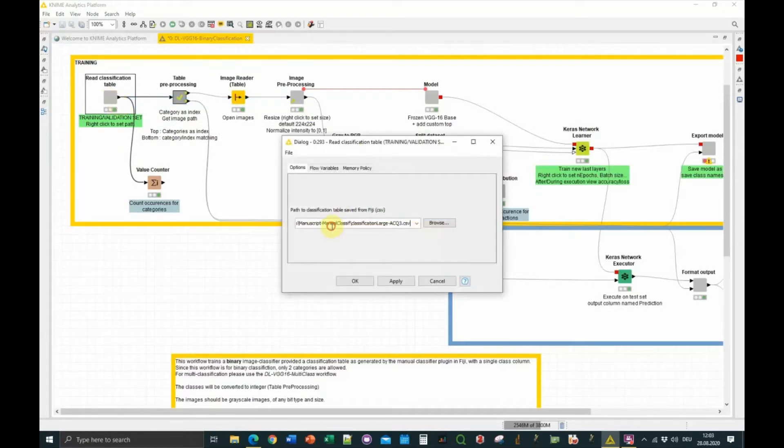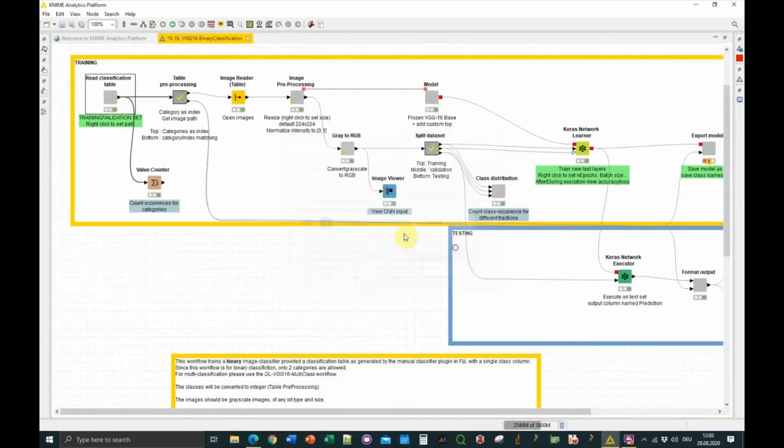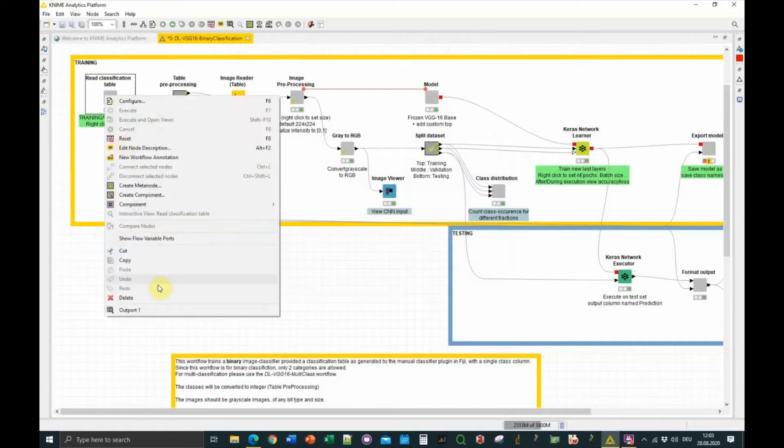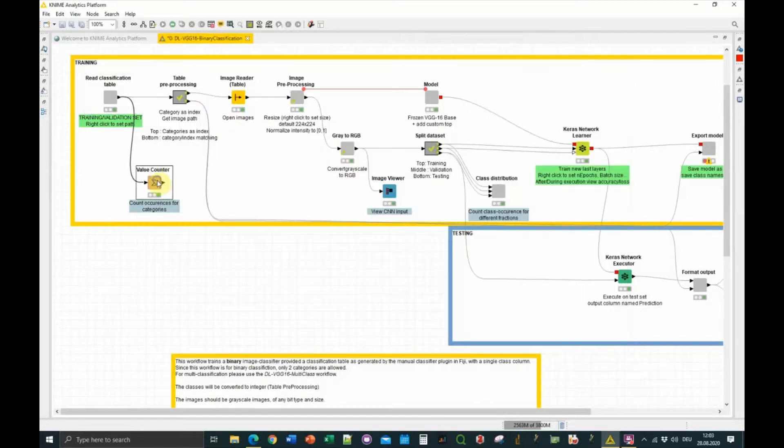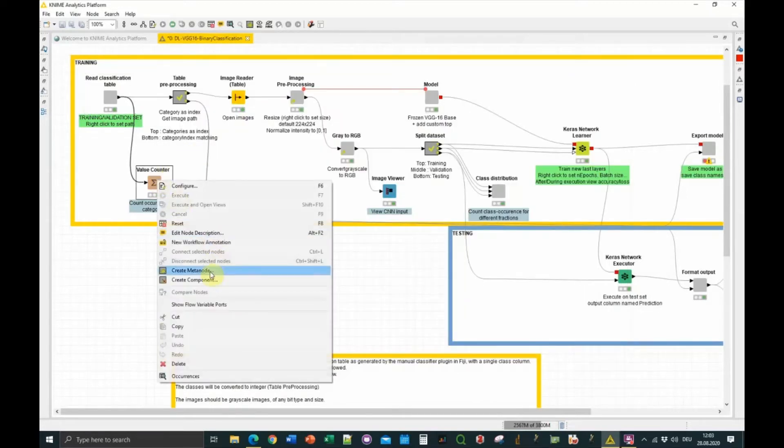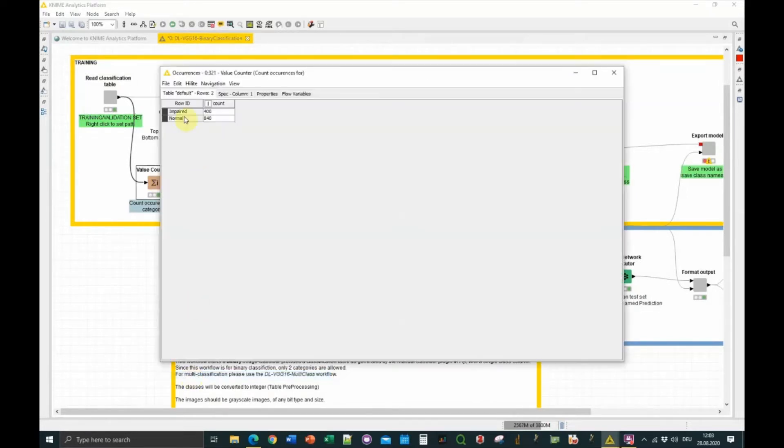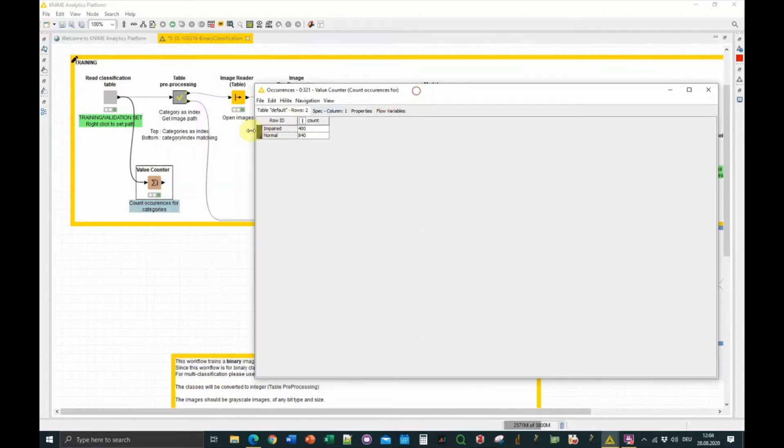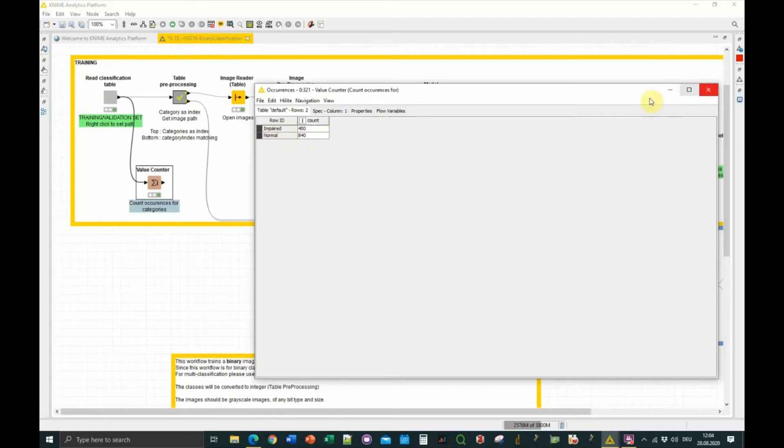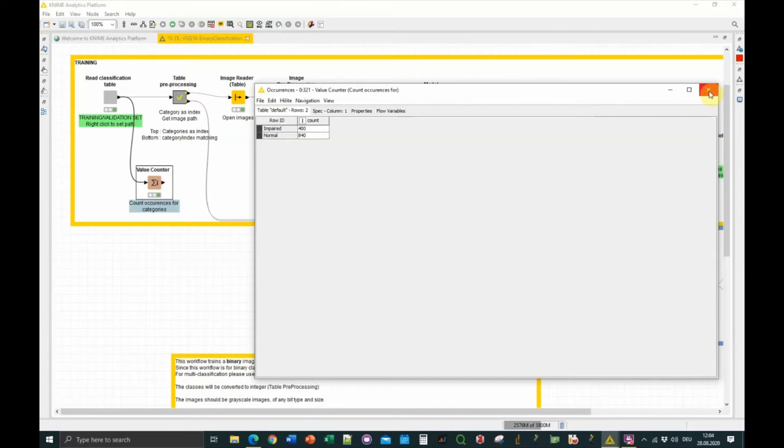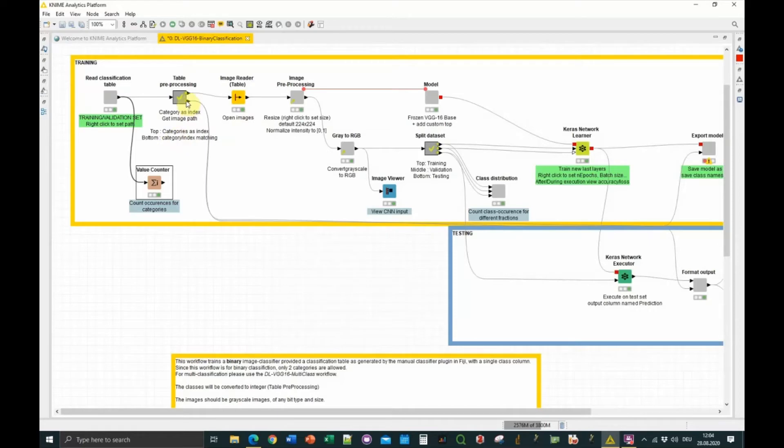We can count how many occurrences of every category we have. We currently have 400 images for impaired, 800 for normal, because the impaired type is not as common as the normal. I would advise normally to have a balanced dataset, so as many impaired as normal, because now the network might better learn the normal category than the impaired. Also here, I've quite a lot of images. You can decrease this amount to 100 images, which should be sufficient, even maybe 50 images depending on the cases.